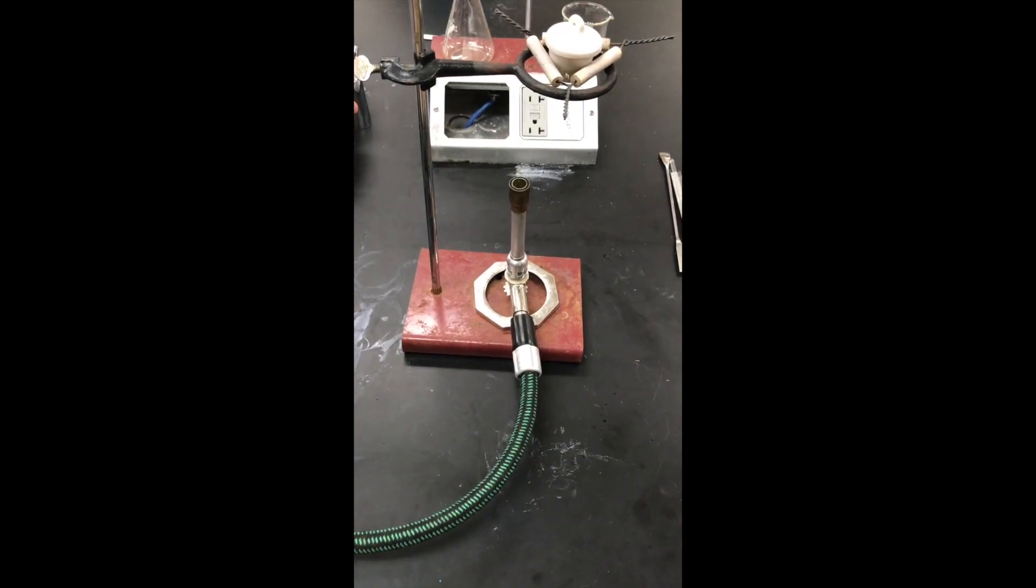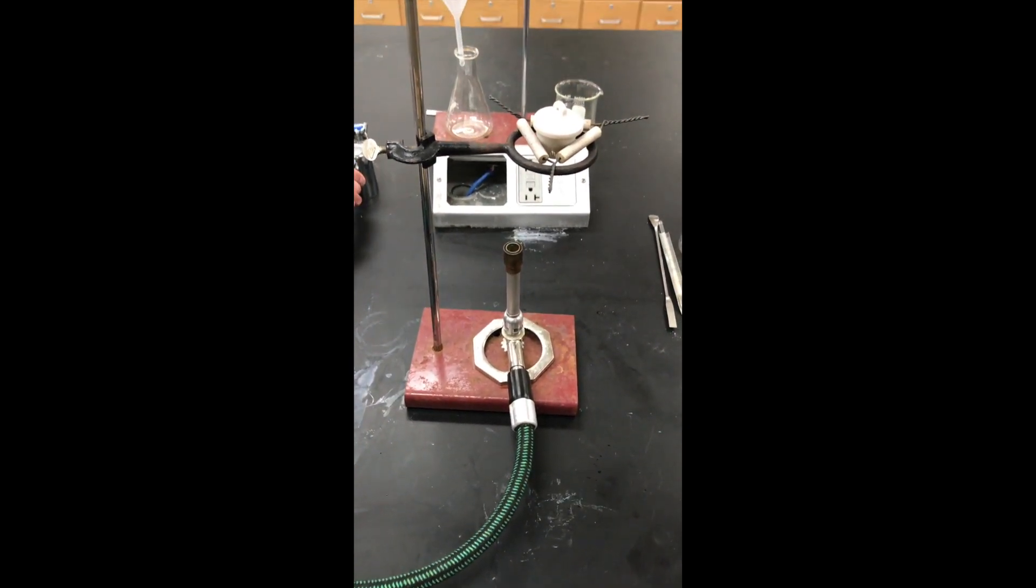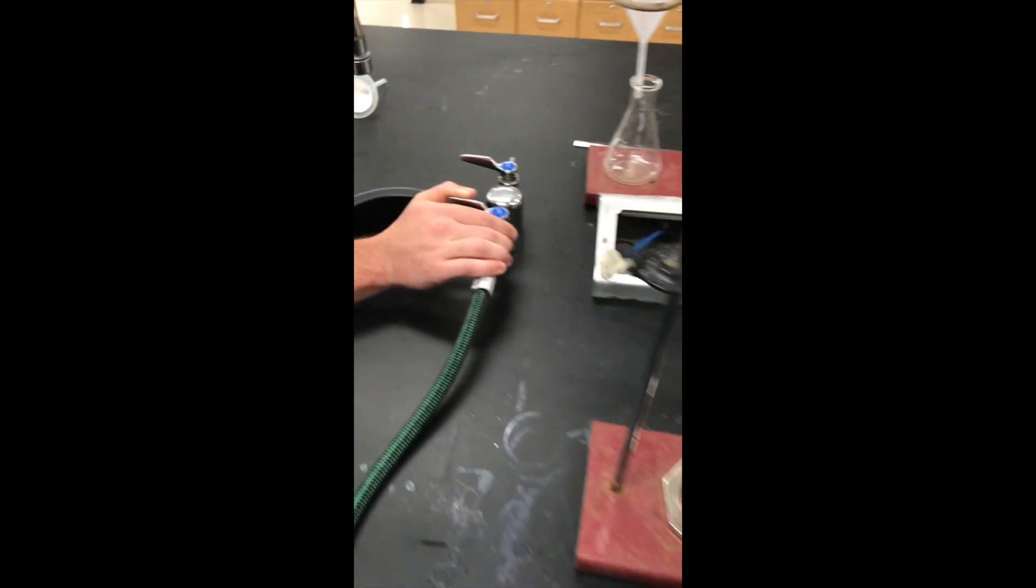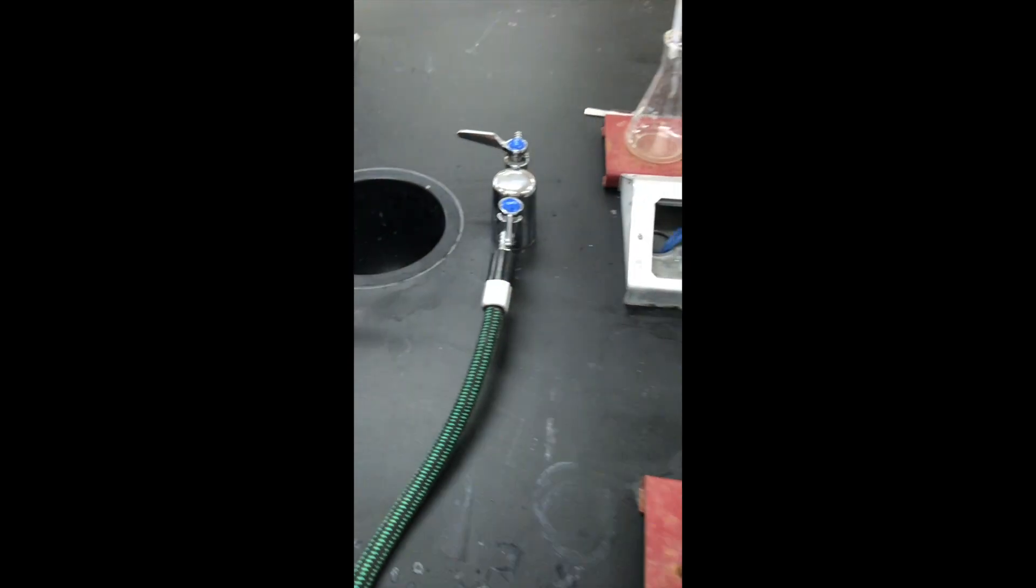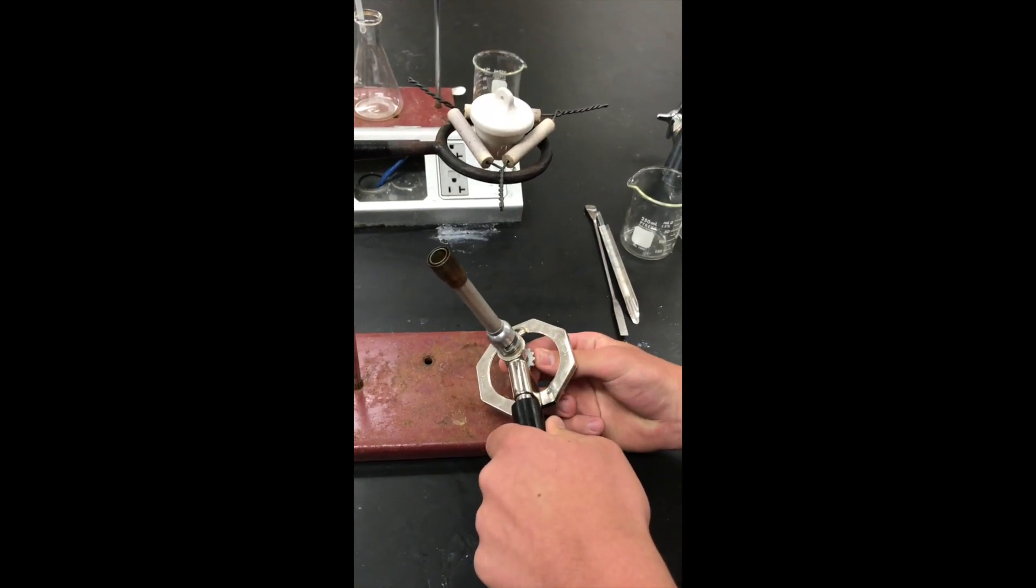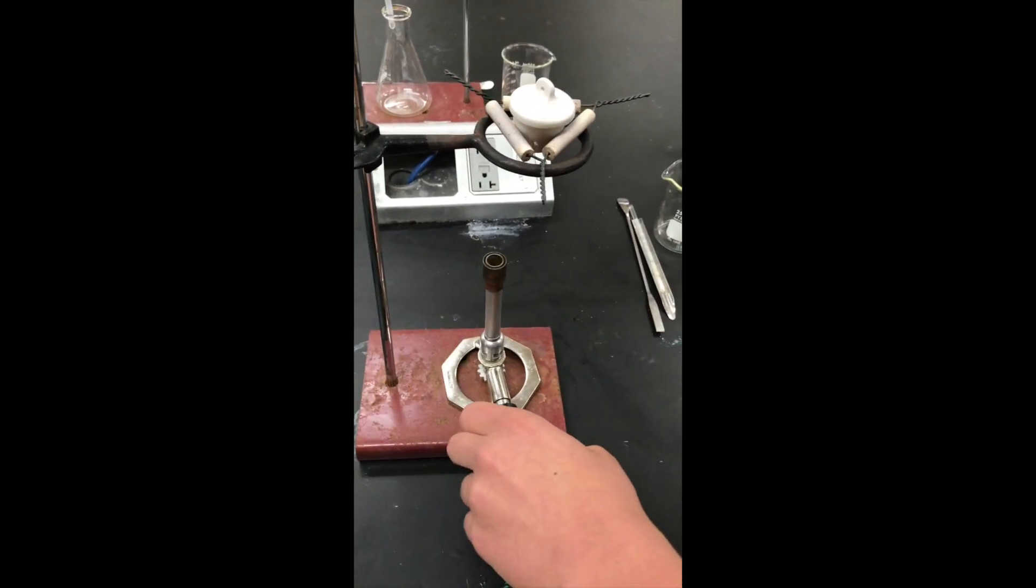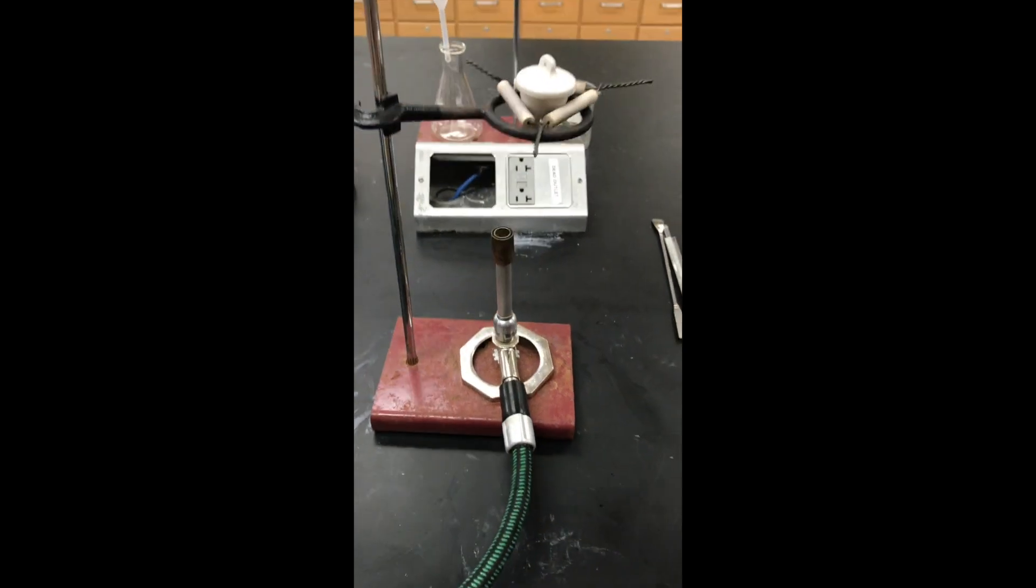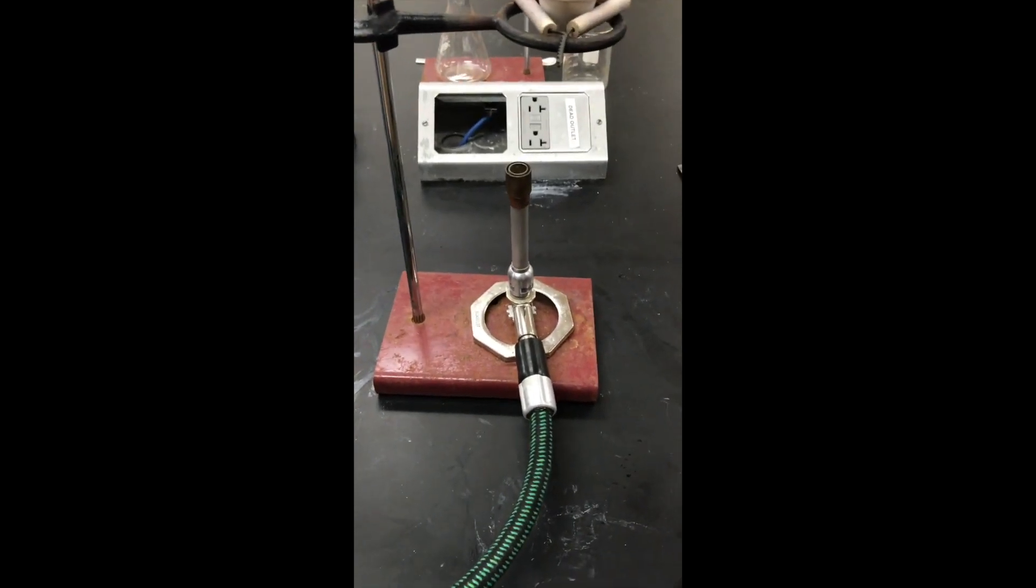Now we will show you how to put all four pieces together and use them properly. First, you will turn on the gas. Gas activated. Now you will turn on the Bunsen burner to allow the gas to come through the flame.